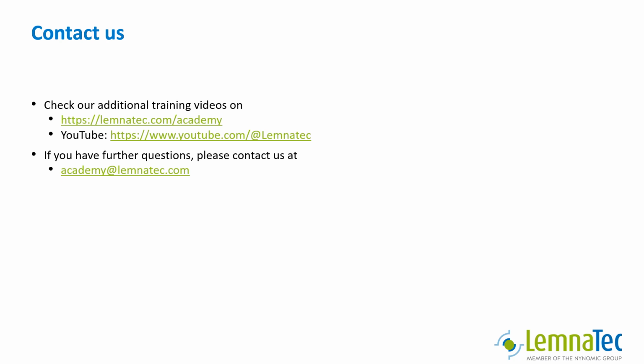This video has covered the introduction to the LemnaControl software in case of a PhenoAIxpert Pro. We will provide trainings on hardware and control software with any of the hardware pieces that we deliver. As mentioned earlier, LemnaControl always is made corresponding to the current hardware.